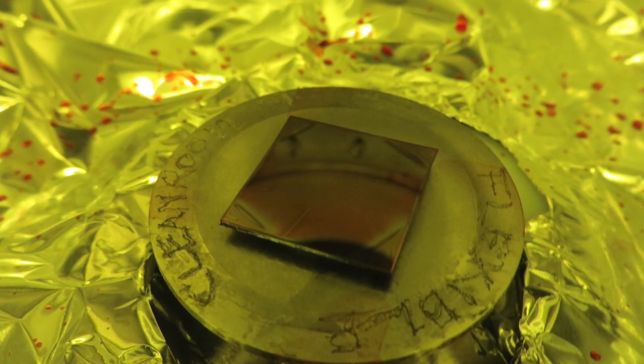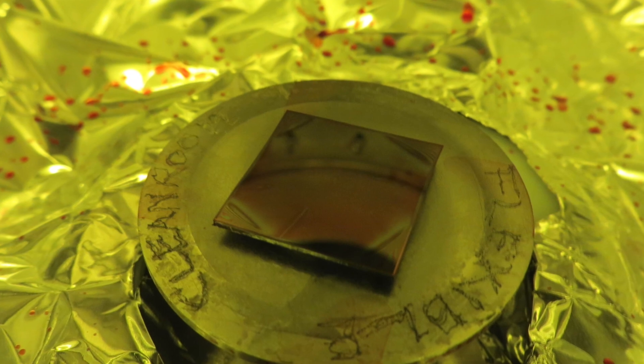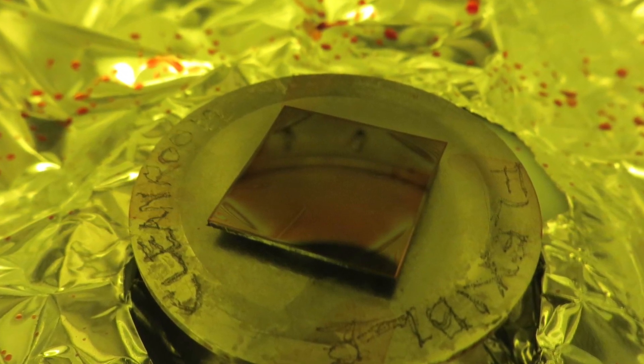If you notice your resist is all lumpy and uneven, then most likely you are allowing too much time between dispensing and spinning. If it sits on the chuck too long prior to spinning, the resist can gel up or get a skin on it which makes it spread unevenly.